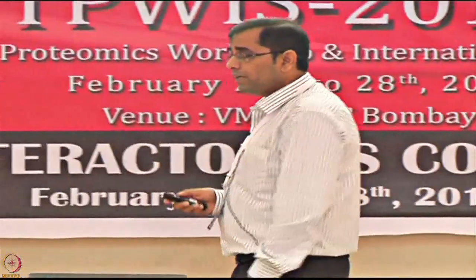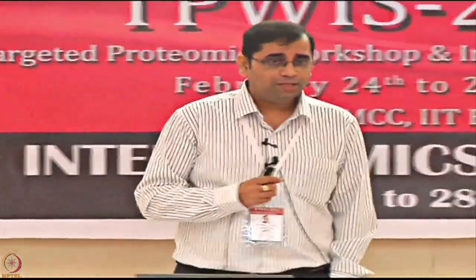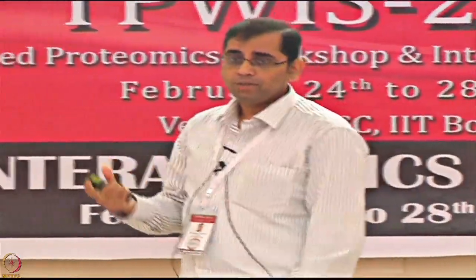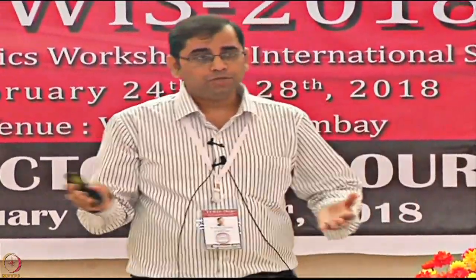Of course, we are talking in this course about high-throughput platforms. I'm sure with Josh's talk you are pretty much convinced that if you have chips which can screen 10,000 proteins, you are going to get very high quality data. You are reducing your time, you are reducing the cost, and the variation that comes from doing too many experiments, if you had 1,000 proteins on one chip versus 10,000 on one chip, right?